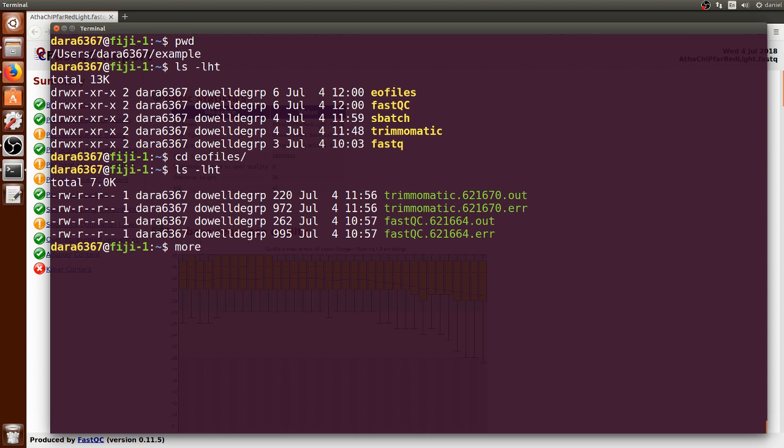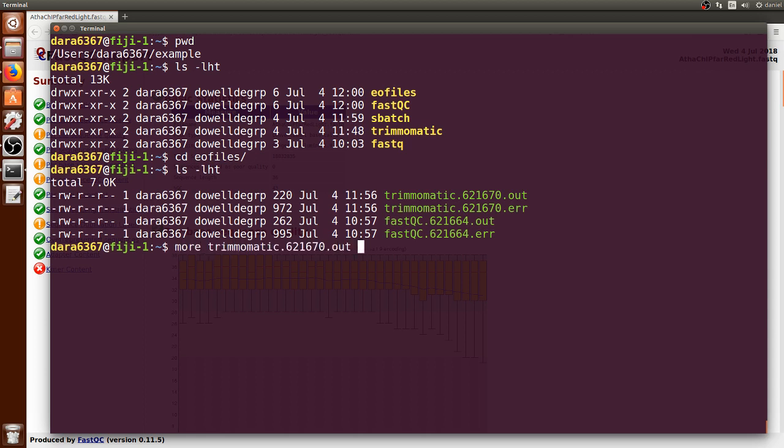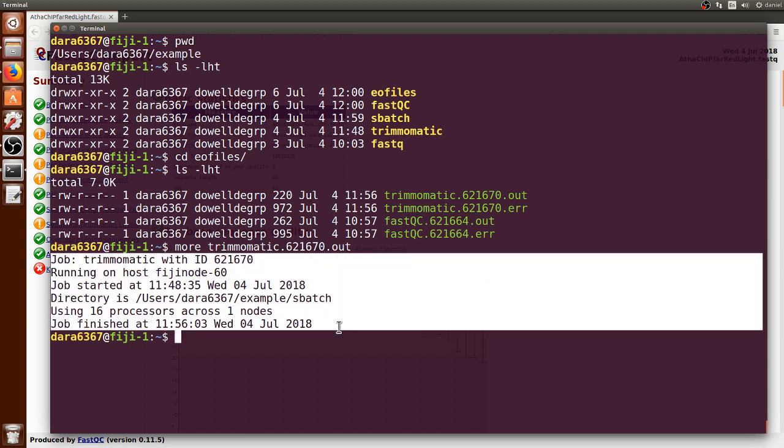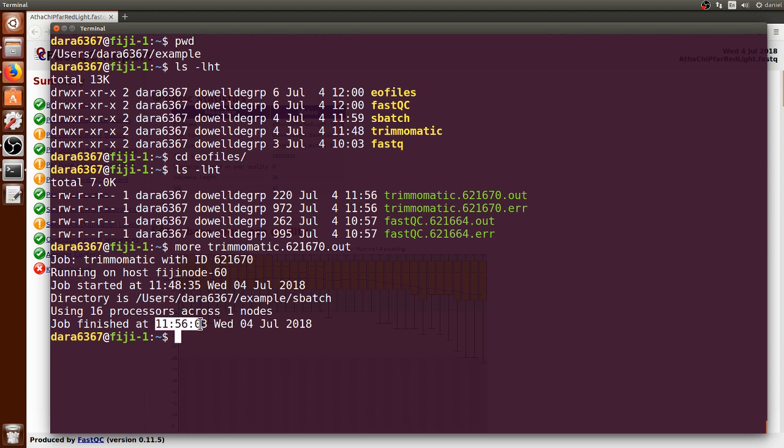We list its contents and we can see that there are two new Trimmomatic output files. We can explore them through the command more, autocomplete, and the output. Here it shows the context of the job that we asked the sbatch file to store the information. We see that the job started at this time and finished at this time, so it took around eight minutes to run.